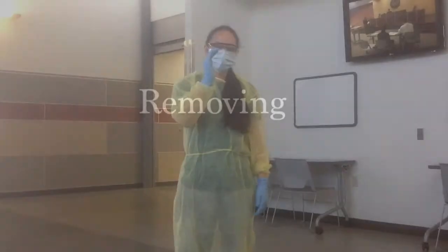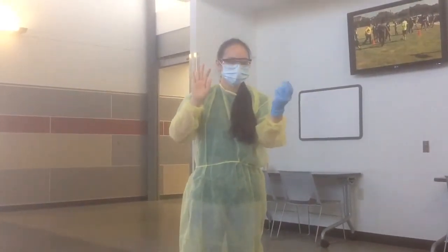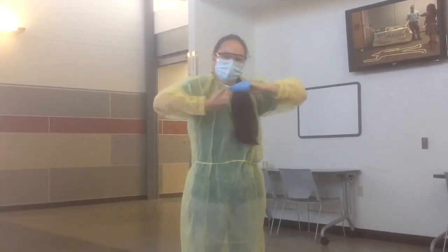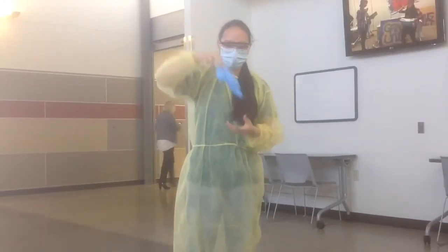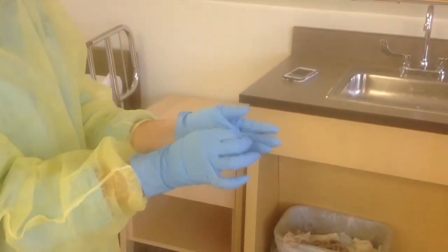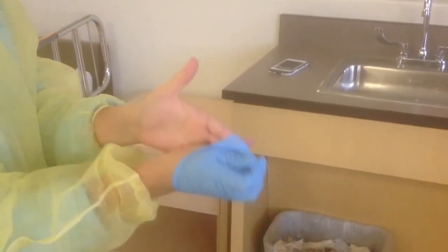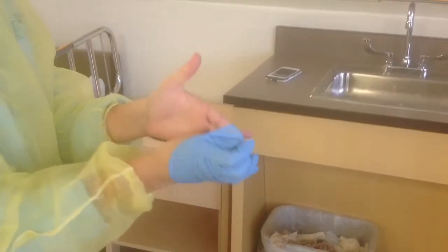When removing, you first take your gloves and take them off. There are two ways of removing gloves. The first way is to pinch the palm of your hand and pull it off your hand, to crumple it. Then take two fingers, put them skin to skin under the glove and pull it over your hand. Then dispose of it.